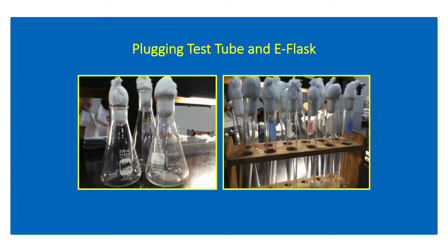Plugging is done to avoid contamination of the media in test tubes and flasks after autoclaving. Cotton and gauze are used for plugging because it allows sterile air to enter the media for aerobic culture requirement, consequently preventing any other unwanted microorganisms from contaminating the culture media.